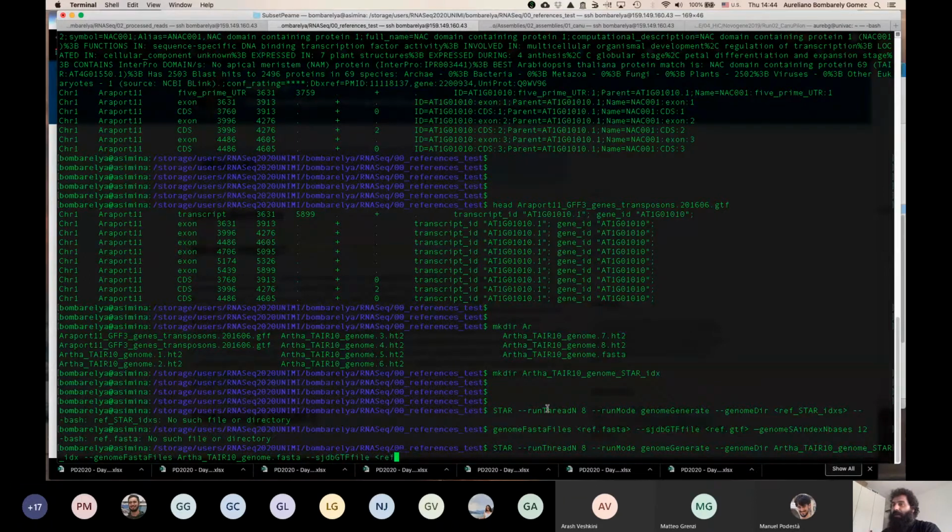So my GTF file will be ports GTF, and then the last one. Keep in mind that if I run this, it's going to give me an error, because instead of those 2 dashes, I have just a big single dash.